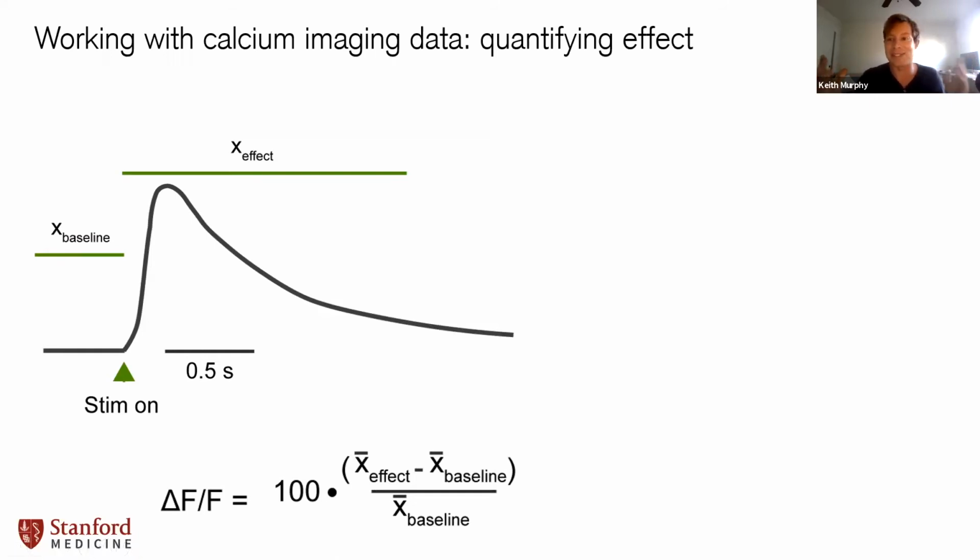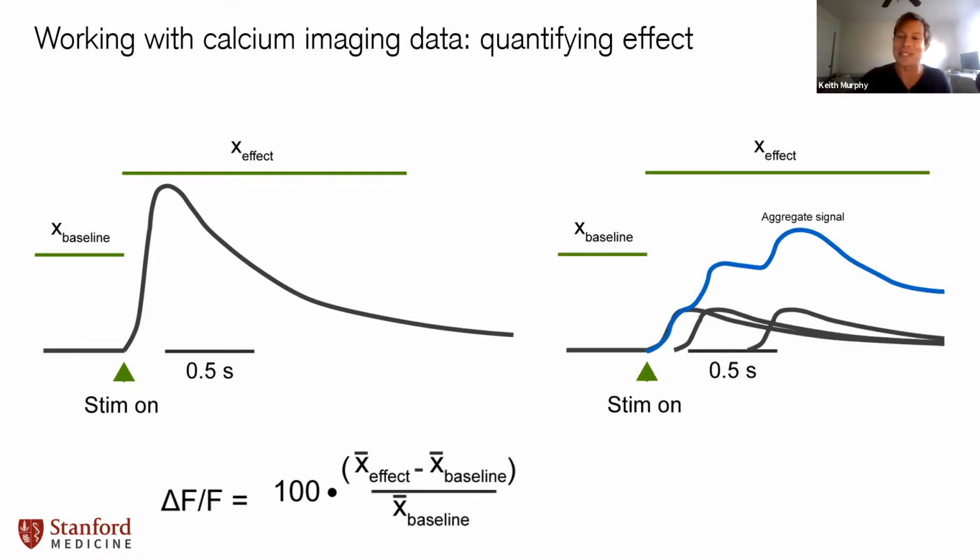You don't have to do that. It's arbitrary, but you can. Whenever you look at fluorescence data and relative values, just know that they don't mean anything at all without a control. You can do crazy things to these numbers, and someone might say, oh, they have a delta F over F of like 100. That's really big. It's not. They're just making up different ways of analyzing. You always have to look relative to the control. And the signal can go down as well, so you could have a negative delta F over F. Absolutely, you can. In fact, if you're looking for inhibition, you really prefer a drop in effect.